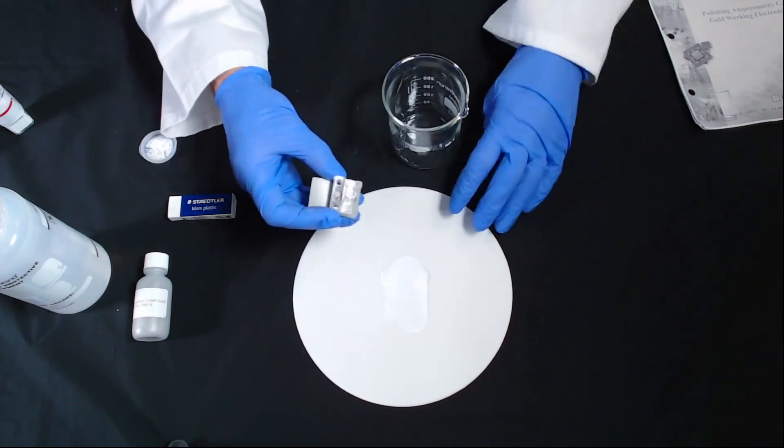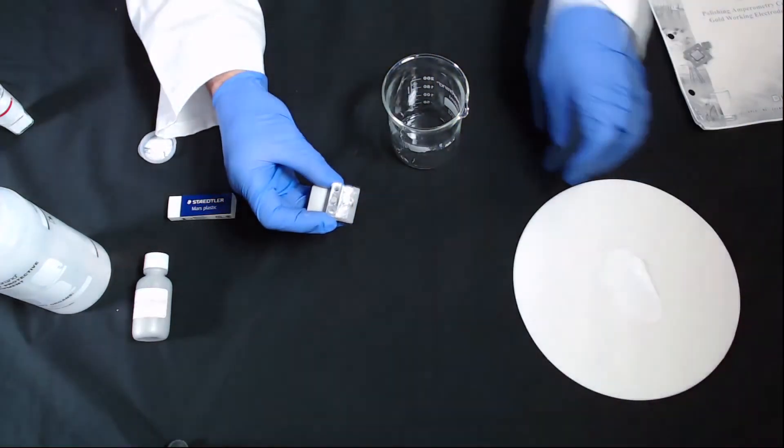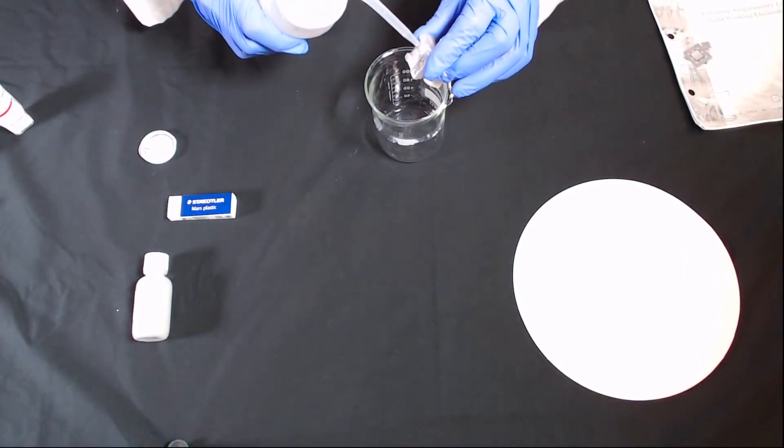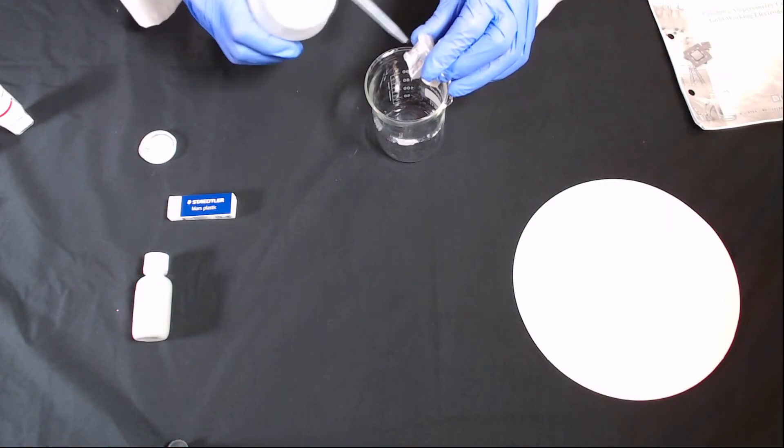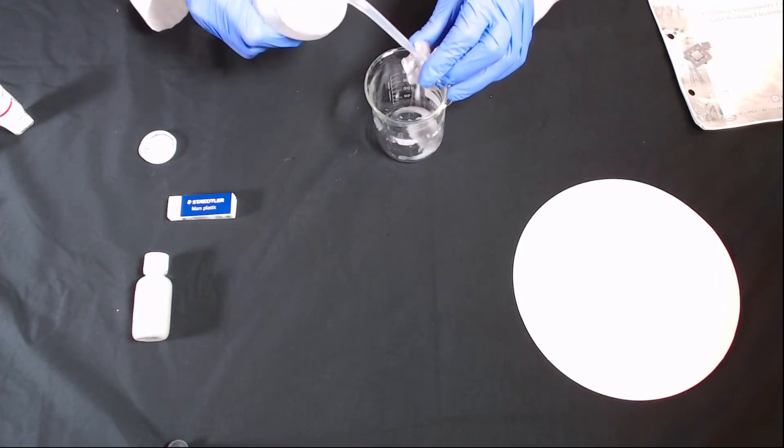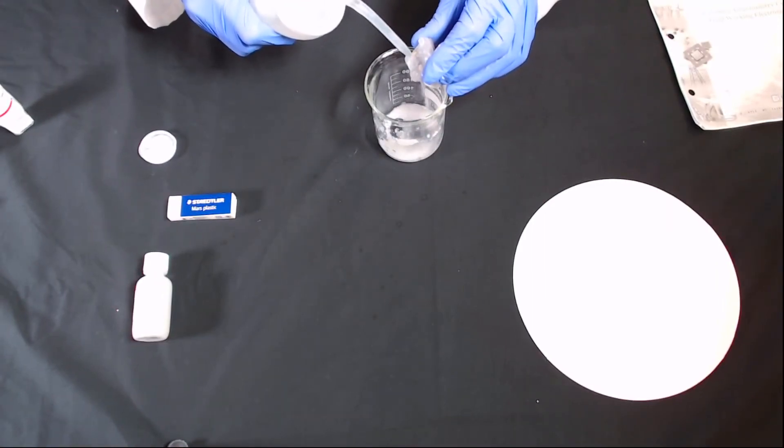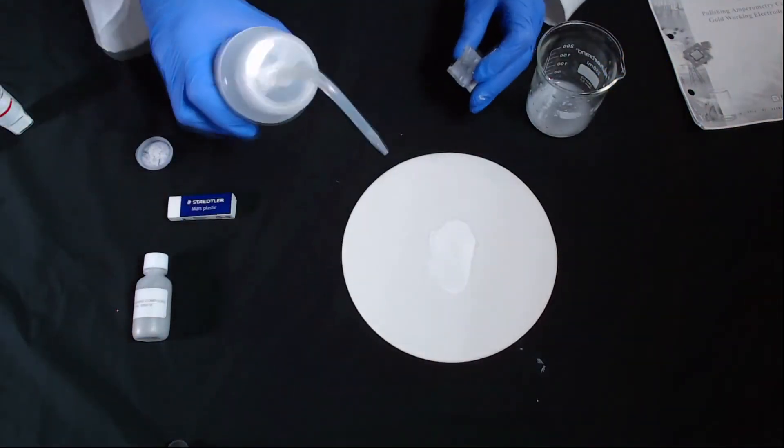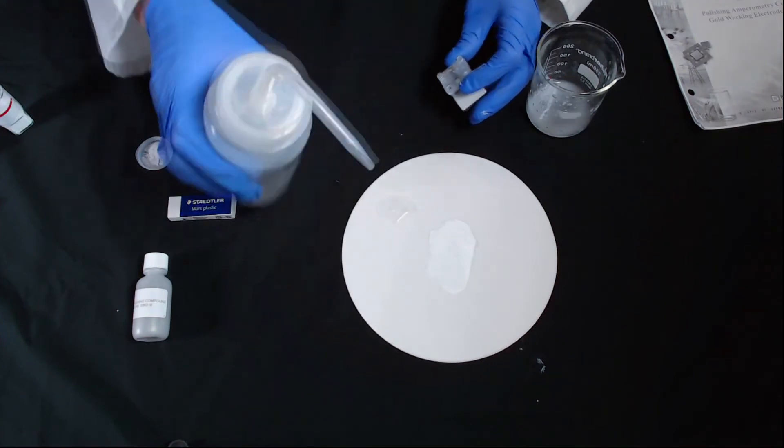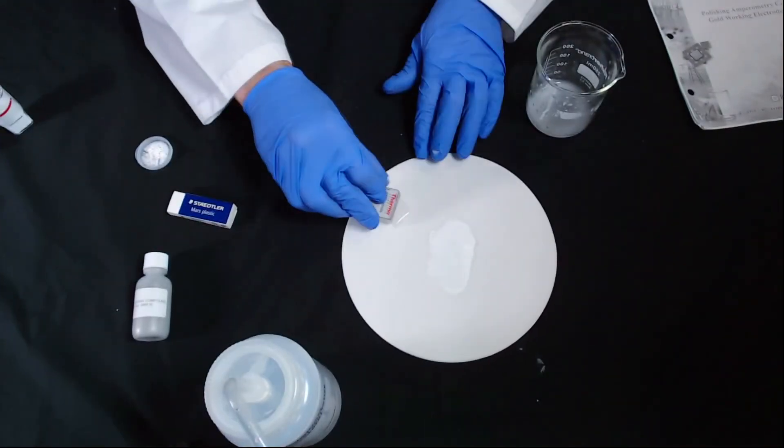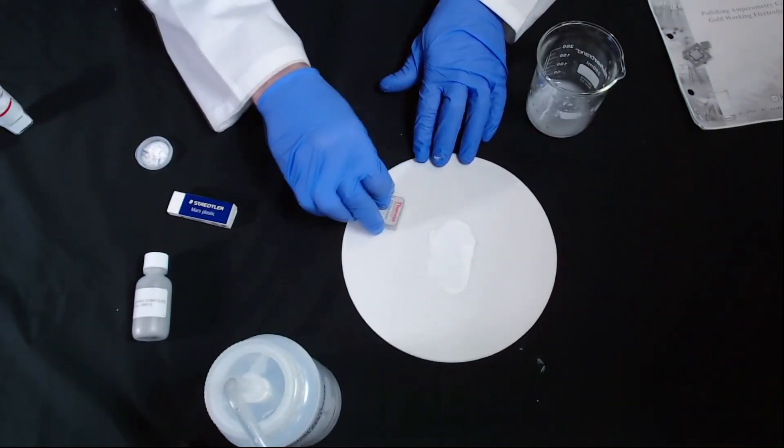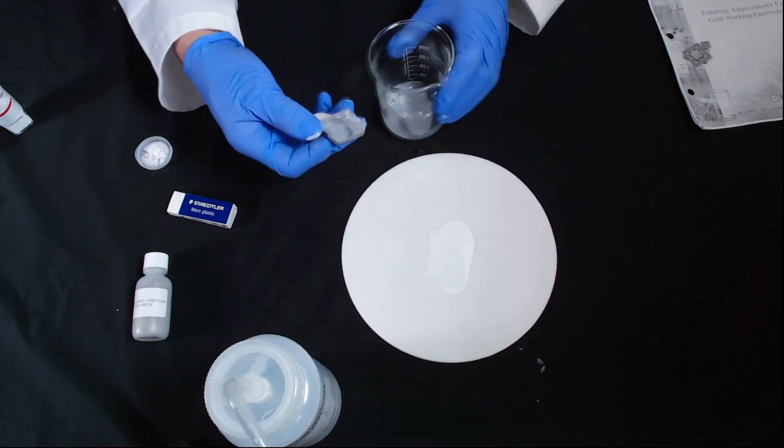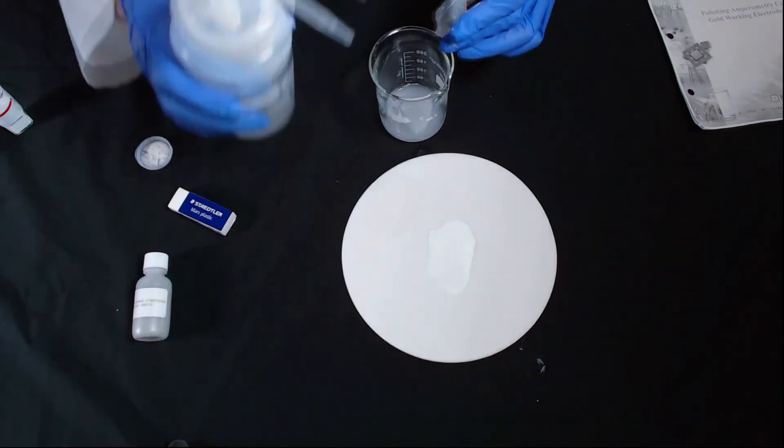We'll obviously polish for longer than that normally, and it's important to rinse off the electrode afterwards. We're going to take our beaker and use the wash bottle to rinse off the compound. We'll also put some deionized water onto the pad in a different location and use it to clean it off there as well, removing the compound this way. Then we'll repeat that process and rinse it off.